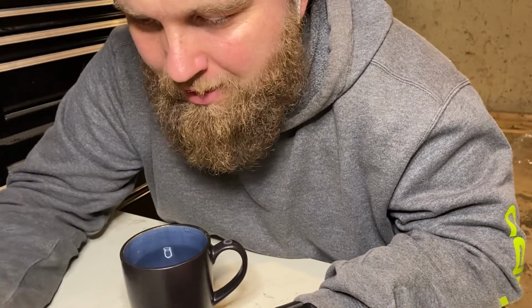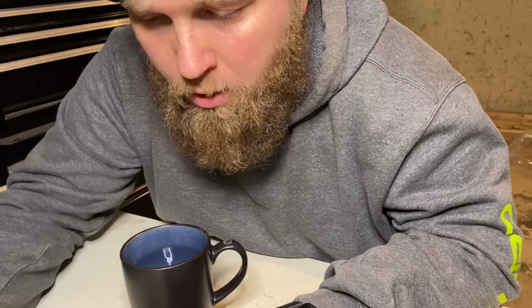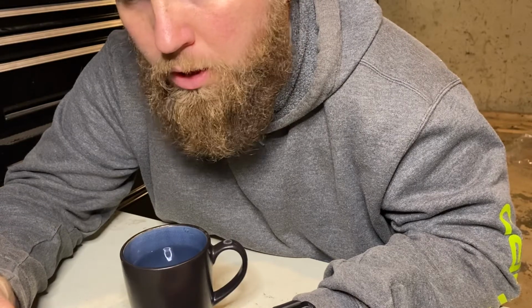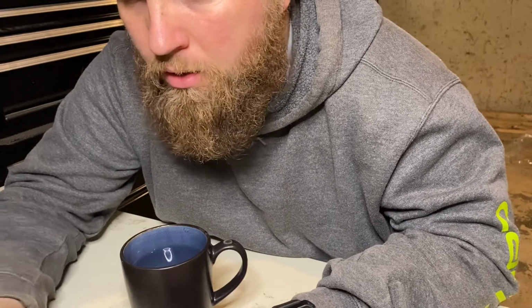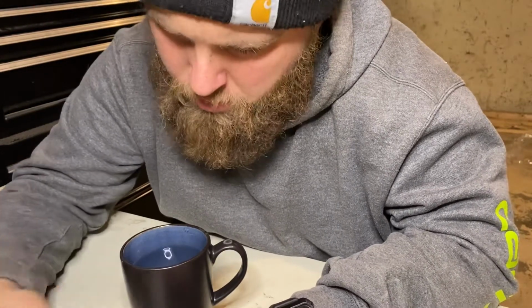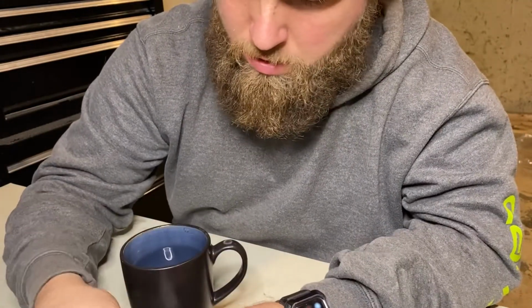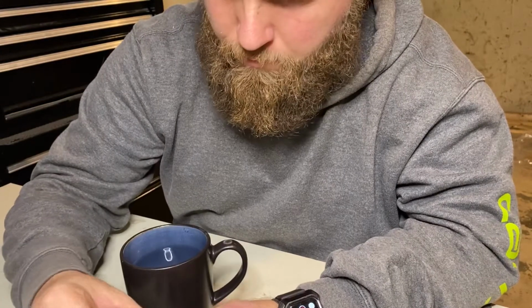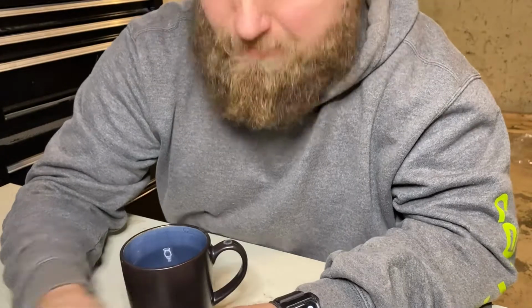So it says test procedures: dip one strip into water sample for 3 seconds, remove and immediately match with the closest color. Color is stable for 1 minute. So pretty quick process. So here's what we'll do. Got a total hardness, yep. And nice little rip open here. If I can get the thing to, there we go.